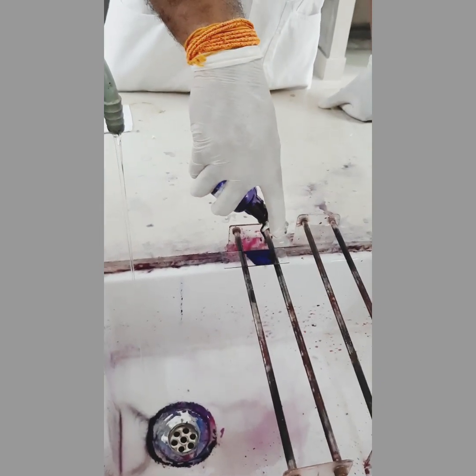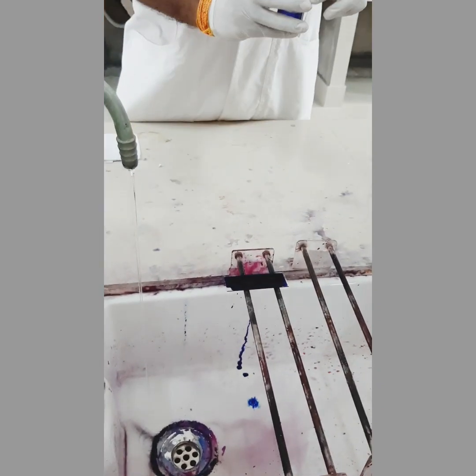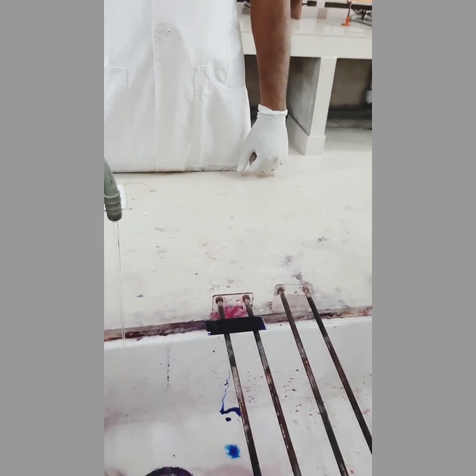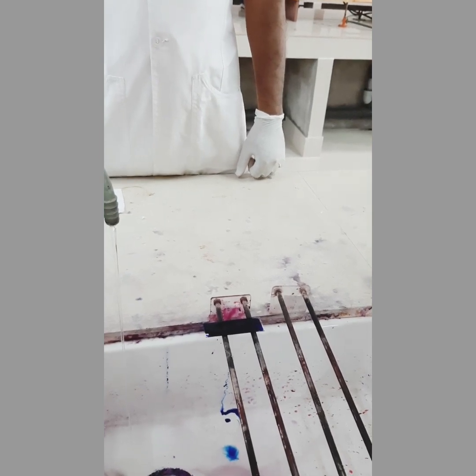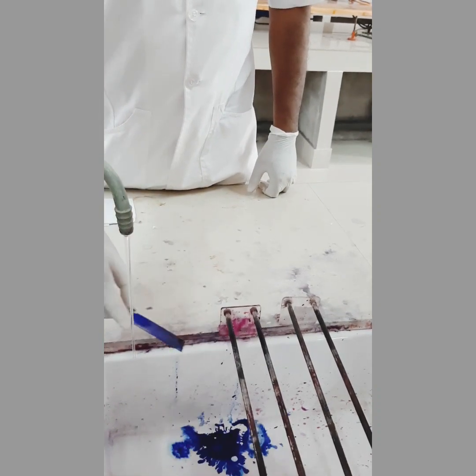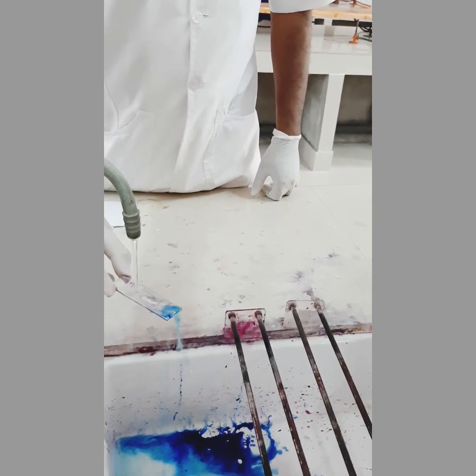Then we are going to the last step, Loeffler's methylene blue. Pour it over the slide and keep it for 1 minute. In this staining procedure, you have to pour the stain over the entire slide, not like in the Gram stain, where we pour only on the smeared area.